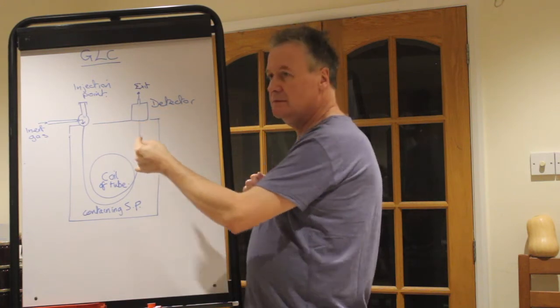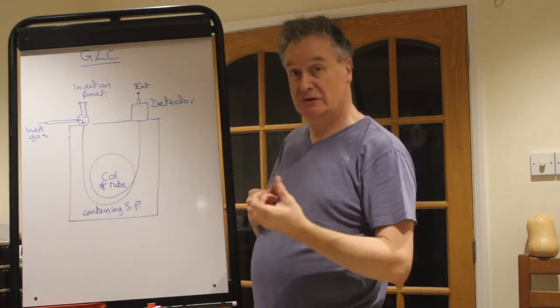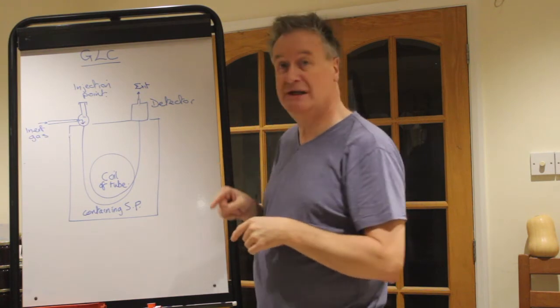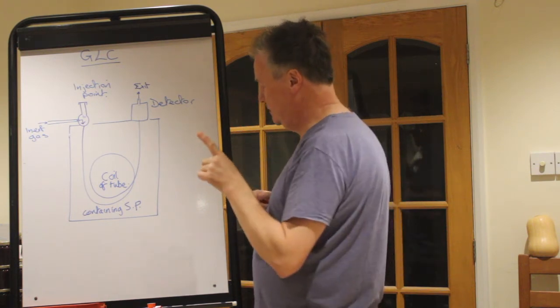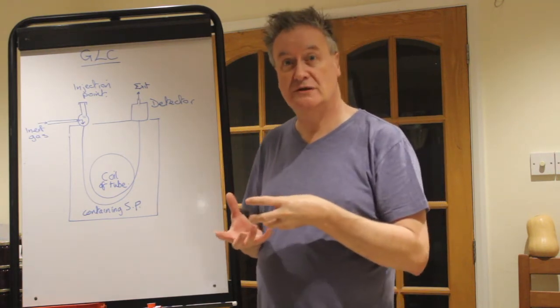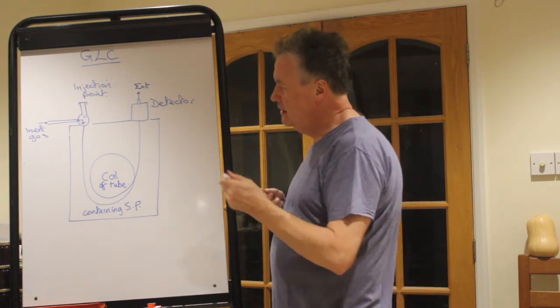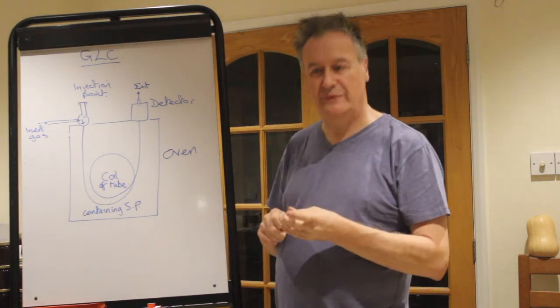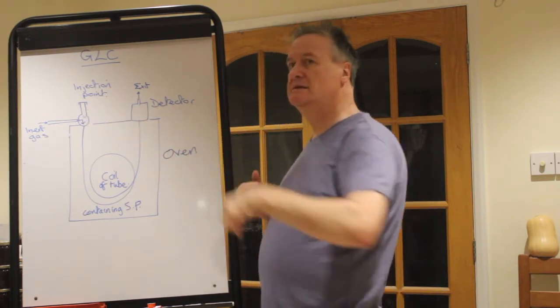And so what you have is a flow of gas through there. You inject, literally with a tiny syringe, the chemical mixture into the inert gas stream as it goes through. But there's a really important thing missing from all of this, because if you're injecting some solid that has been perhaps dissolved in a solvent, you're injecting a liquid in. It's not going to go through the machine. So the whole of this box represents the fact that it's all done within an oven, so that everything that you inject into it becomes vaporized.